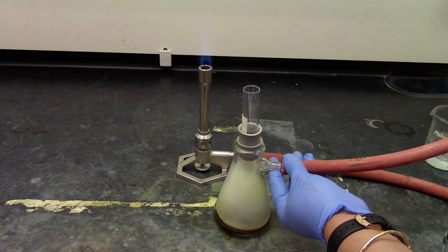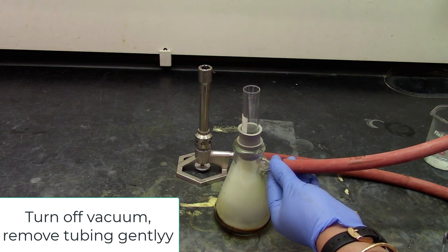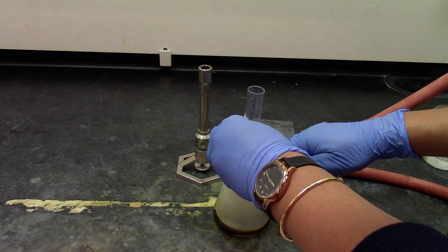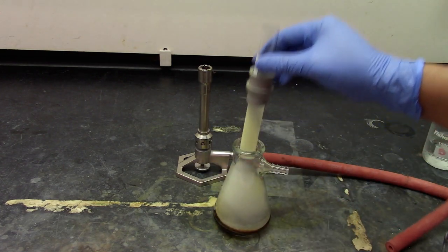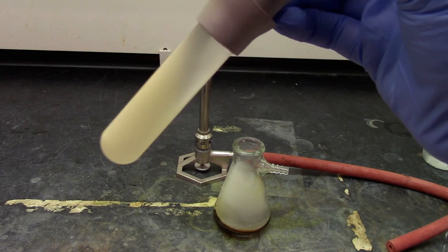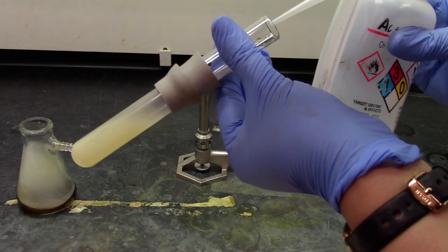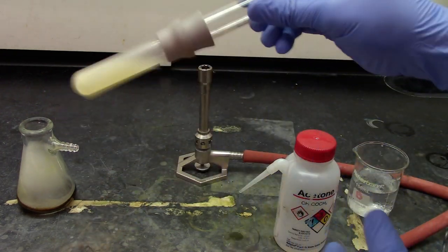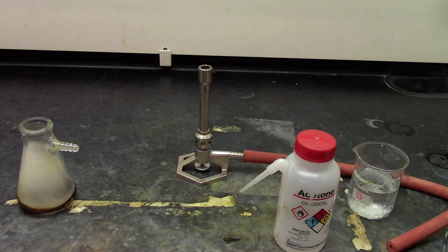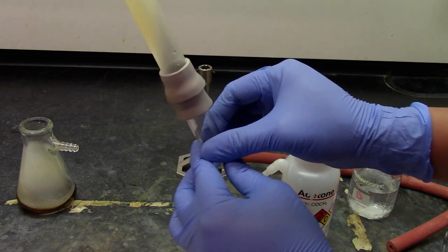Once sublimation is done, turn off the vacuum and remove the tube gently and take out the test tube. You see the caffeine on the test tube. Carefully discard the ice-cold water from the test tube, rinse the inside of the test tube with some acetone, and then blow some air to dry the test tube.